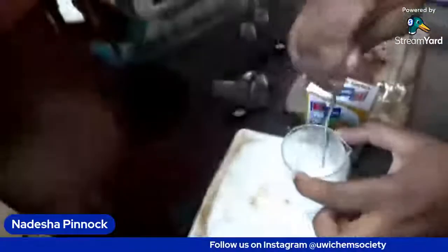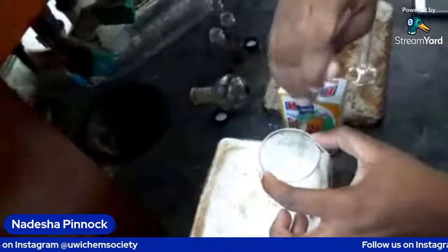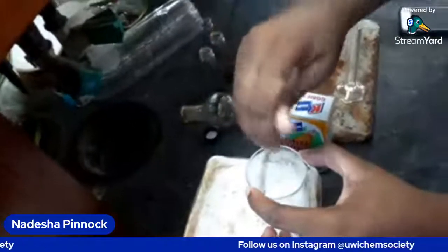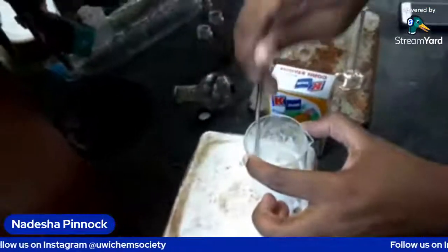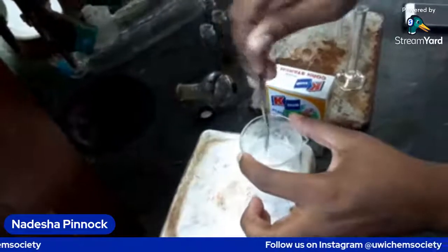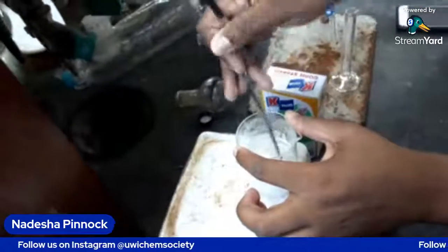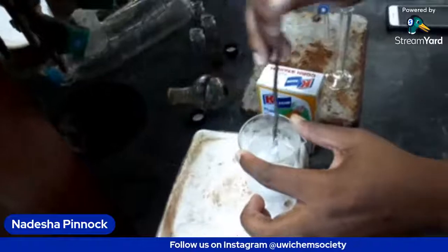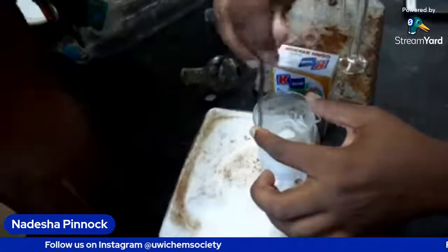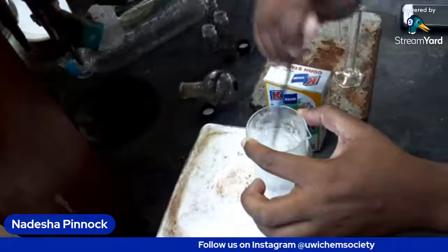Okay, we're getting some solids. So it's thickening, guys. And when it starts to thicken, it starts thickening fast. Not really, really fast. I want this one to be really, really thick. So this is kind of like a butter consistency. Maybe thicker, actually.